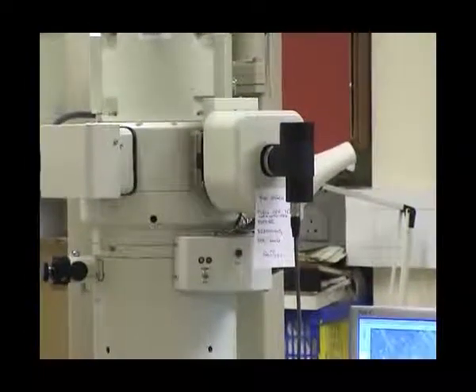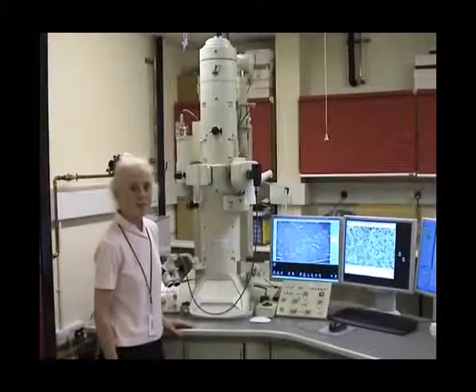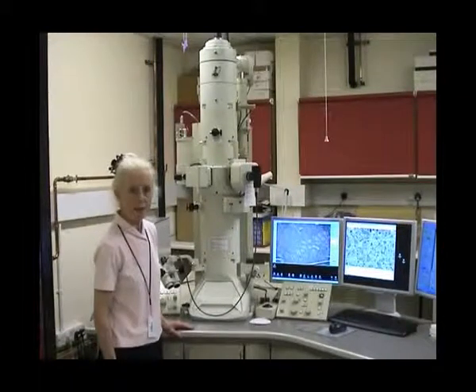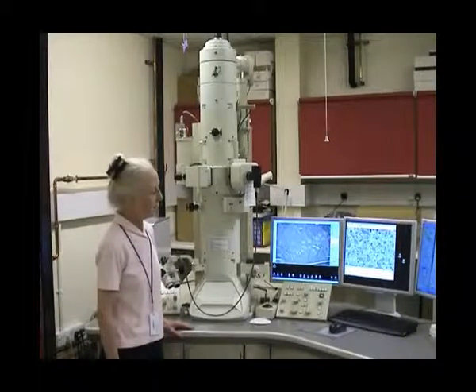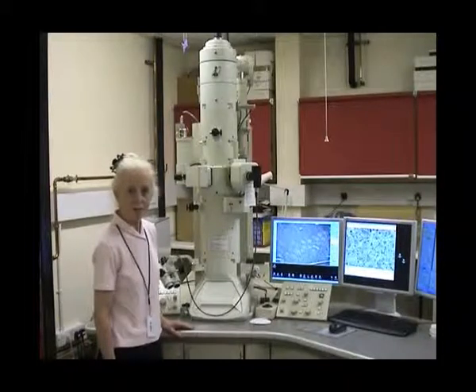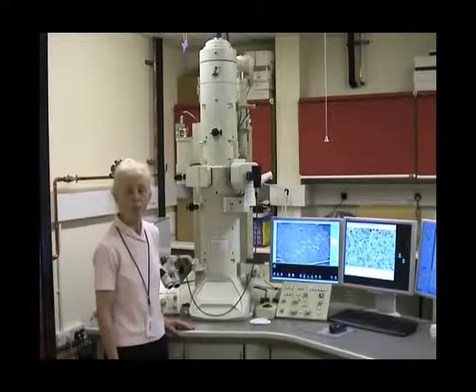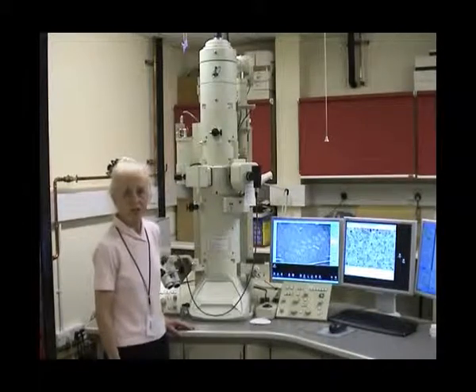The cost of this instrument is about £250,000, so we look after it very carefully, and postgraduate students are permitted to use the instrument 24 hours a day, but we do not have undergraduate students using the instrument. The best way to use this instrument is as an educational resource over the internet, where this can be filmed and used as a virtual research experience.